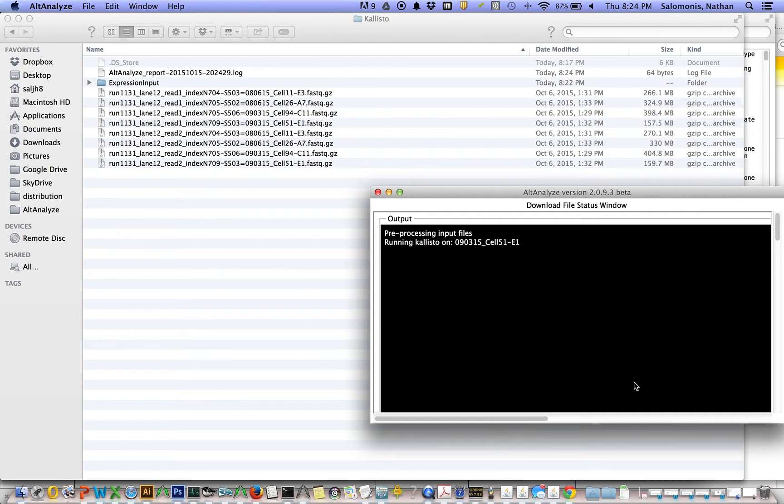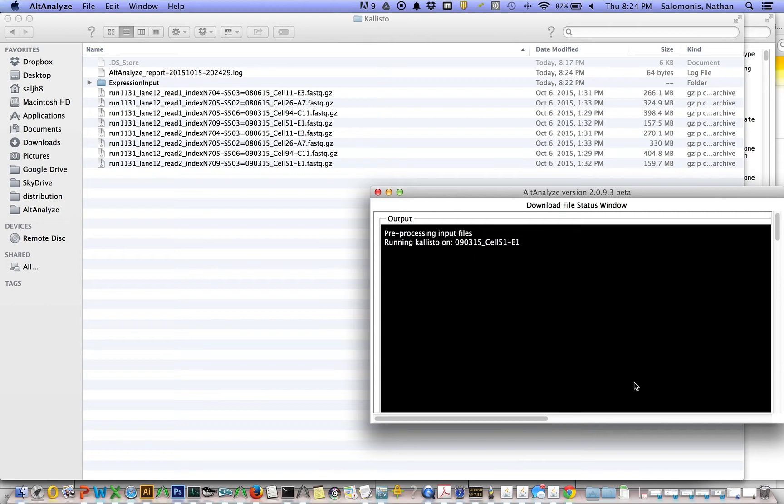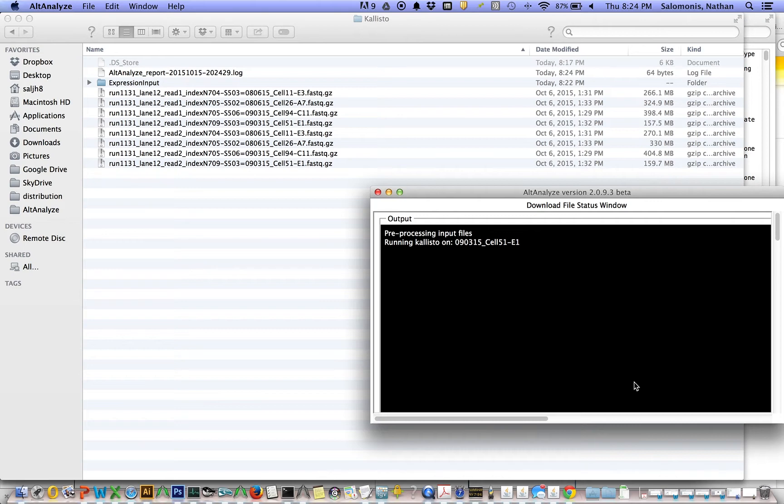So what is the software doing at this point? You'll notice in the background here, in that folder, it created a folder called expression input. Inside expression input, there's another folder named Kallisto. That Kallisto folder, for each one of these samples, results are being pseudo-aligned to the genome. Or actually, not to the genome, but to the transcriptome.